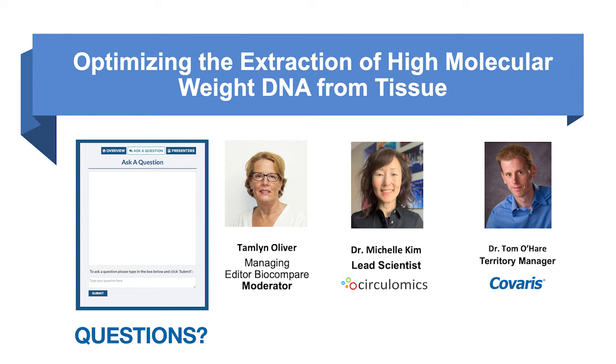I assume this, well, I don't assume anything, but maybe this person is working with insects or some plants. We have different buffers that are not in the tissue kit that deal with samples that have high polysaccharide content. So we have different additives to the buffers that help shuffle those away from the DNA.